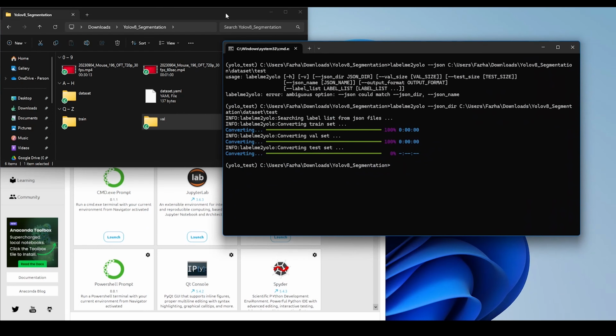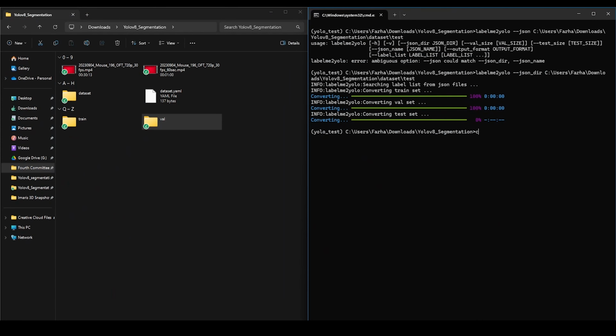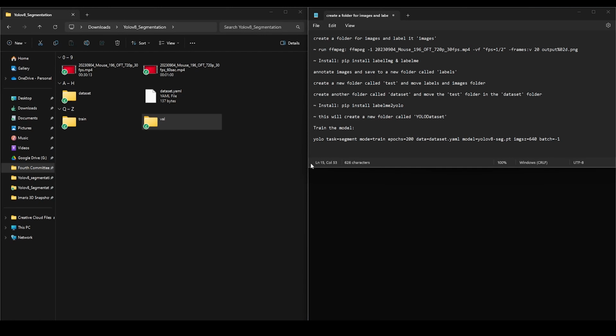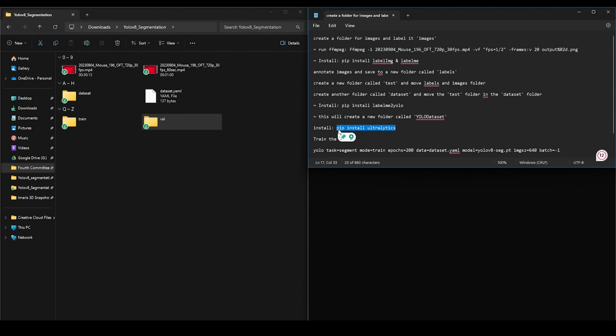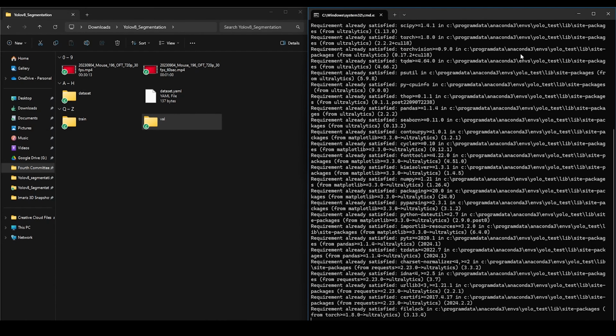All right, now we're ready to train our model. But before we actually train, we need to install Ultralytics. If you have already installed Ultralytics, if you were following some of my previous videos, it will just tell you that you already have it in your environment. But if you're new to this, please install Ultralytics.